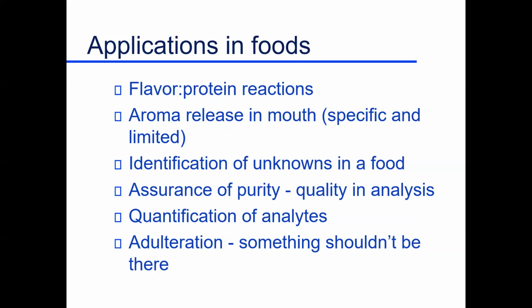And you will more than likely get a separation at that point. So it's not simple. It's a lot easier to publish a list of things than it is to actually get into it and try to determine what these compounds are. And again, a lot of people don't do that. And your data then oftentimes are certainly flawed when they get into the literature.